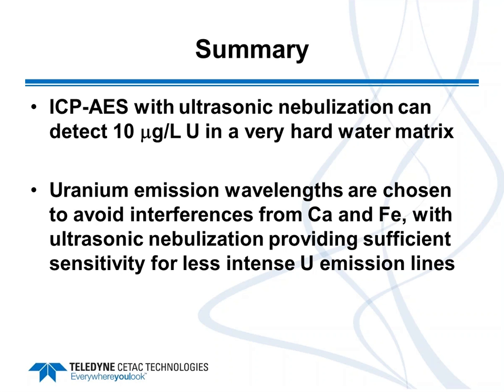Again, okay. Do you have ICP-MS data? ICP-MS. Yeah. The only ICP-MS data we took here was with the standard nebulizer, just doing the check of the uranium in groundwater. Certainly, the ultrasonic nebulizer can be connected and has over the years to an ICP-MS. Typically, then, you're looking more at elements above mass 80, things like rare earth elements and actinides, where you can push detection limits down very, very low.